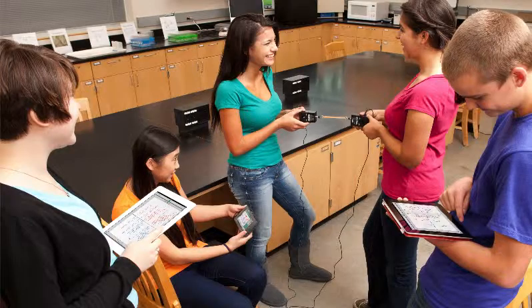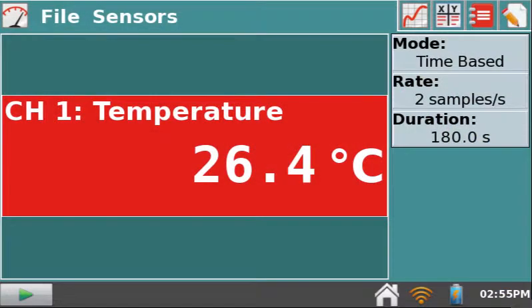Before you attempt to share your LabQuest 2 data with Graphical Analysis for iPad, you must make sure your LabQuest is connected to your preferred network and data sharing is on.